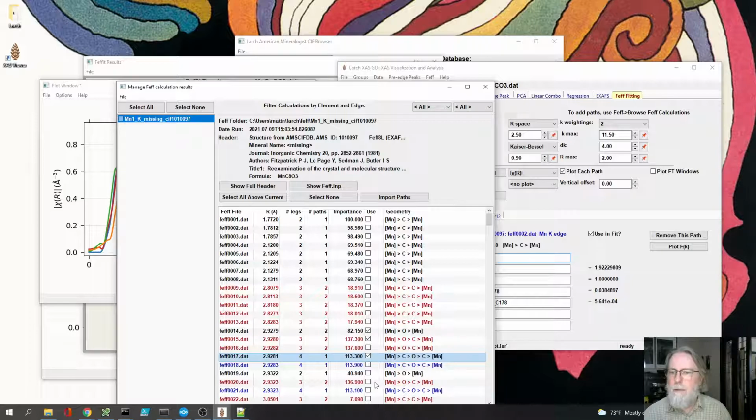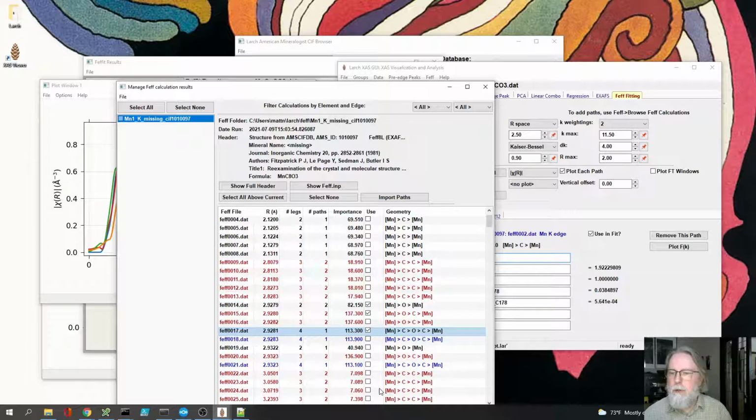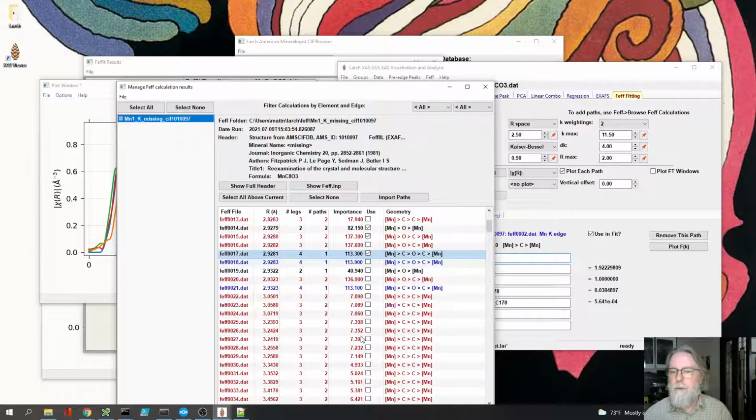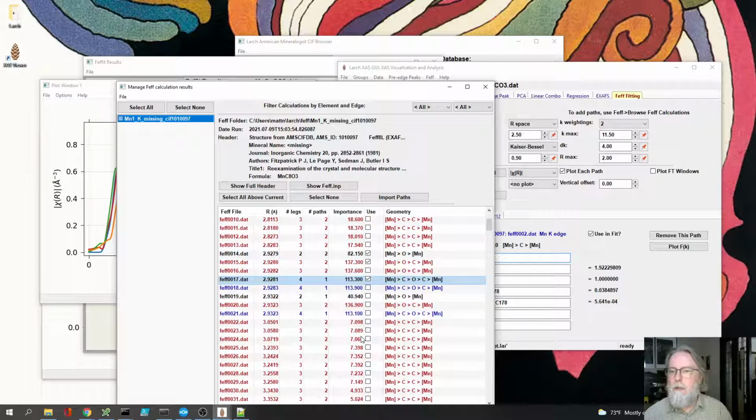There are also other multiple scattering paths within the ring, going from a carbon to another carbon that's not a near neighbor but across the ring. Those all have much lower scattering probability. We'll just neglect those, at least for now. So we'll include these 3 scattering paths.